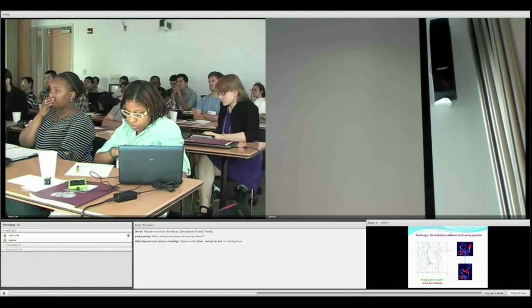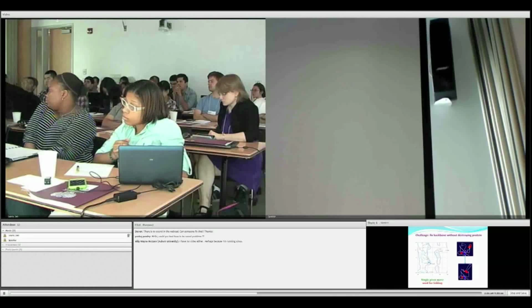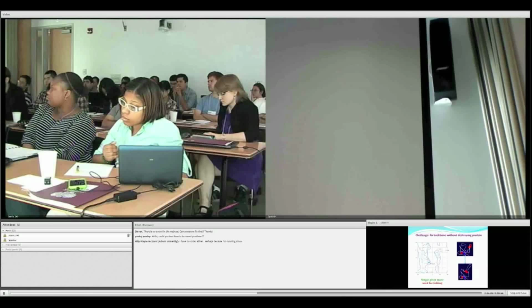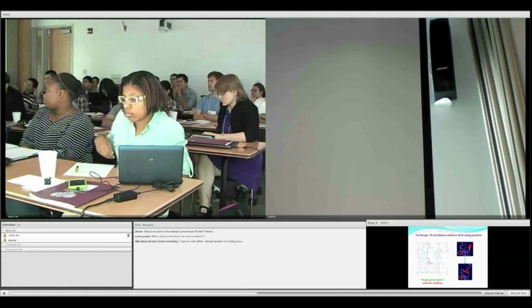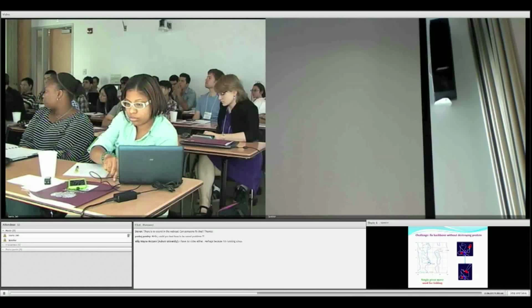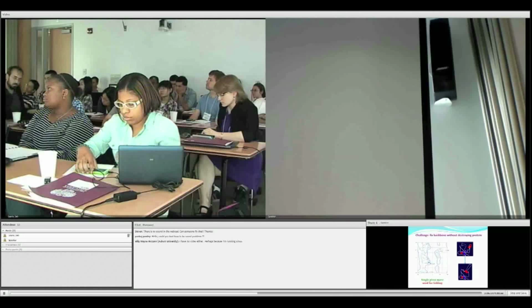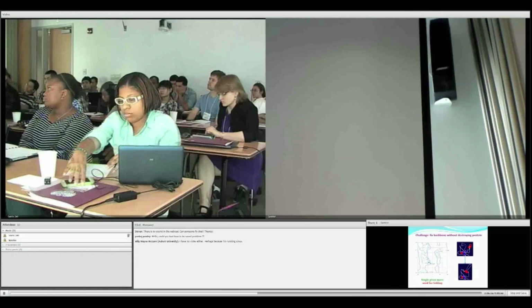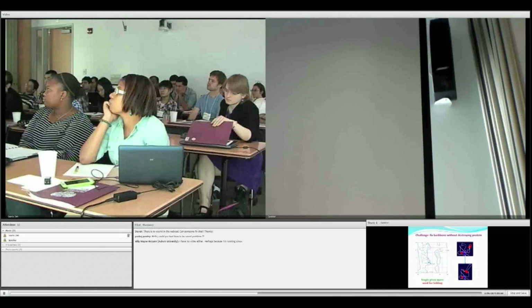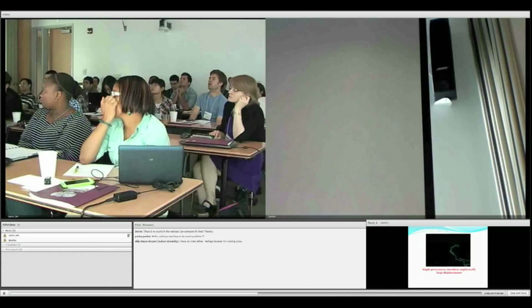So the important thing that I would like you to know is that one size does not fit all, meaning that if you have TSP1 or if you have the general Rama, that does not necessarily mean that you have good dihedral angles based on the fine resolution that we have defined. So how do we do this? Now we know the goal is to move the angles to a better TSP3 scoring.